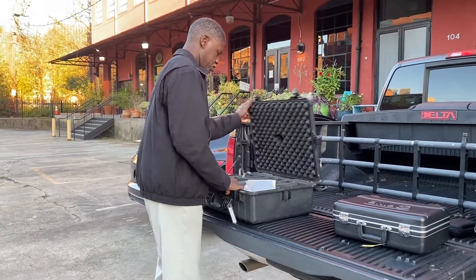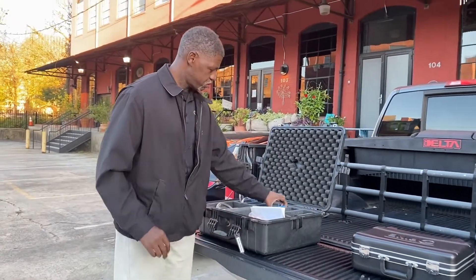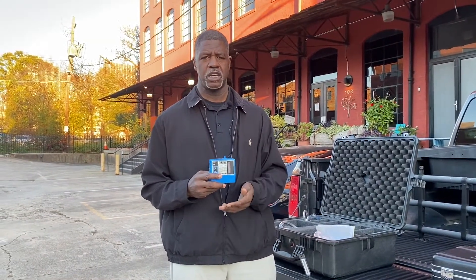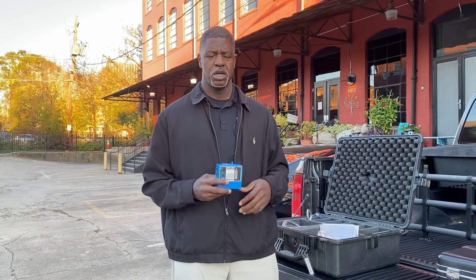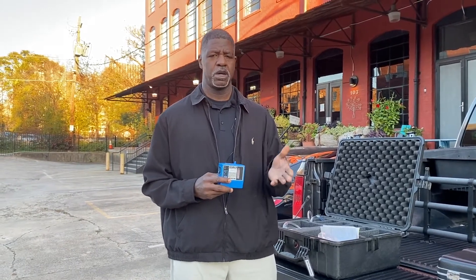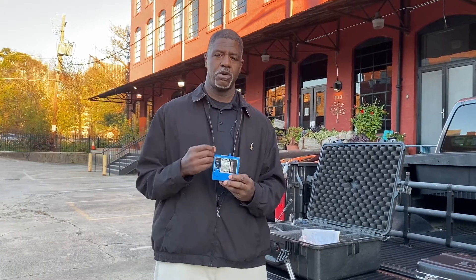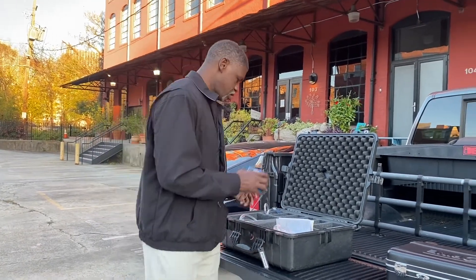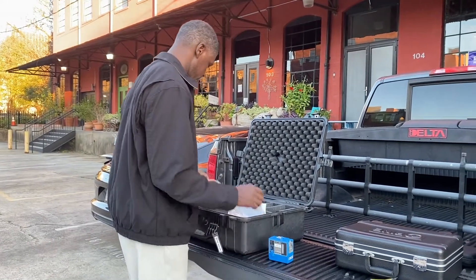Here I have some air sampling pumps. This is the Gill Air — this is what we use for a lot of personal sampling: asbestos, lead, all types of metals, even some of the volatile organics. We've been covering this in the current chapter, and even the colorimetric tubes at a lower flow can be used with the air sampling pump. This is the workhorse of industrial hygiene.